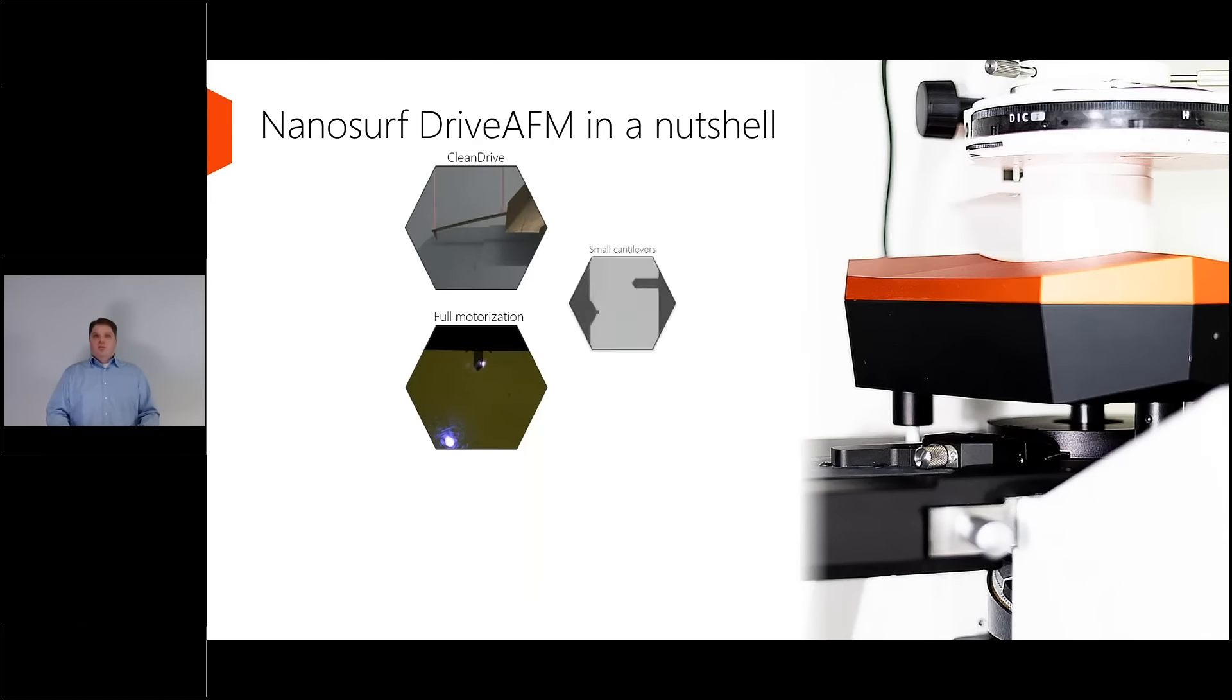We have the small cantilevers which is one component of having access to faster imaging.